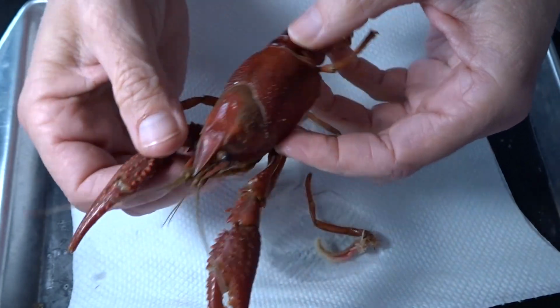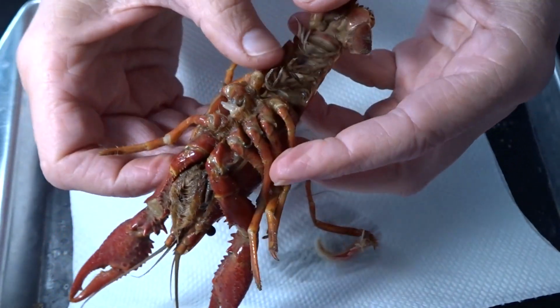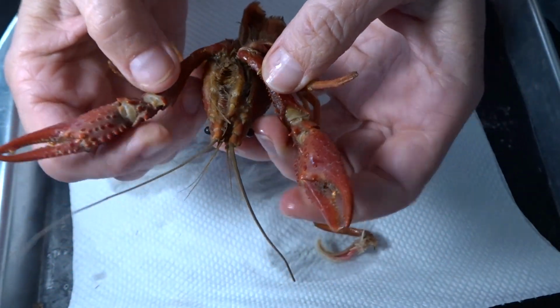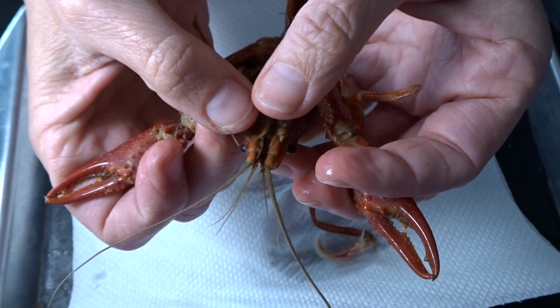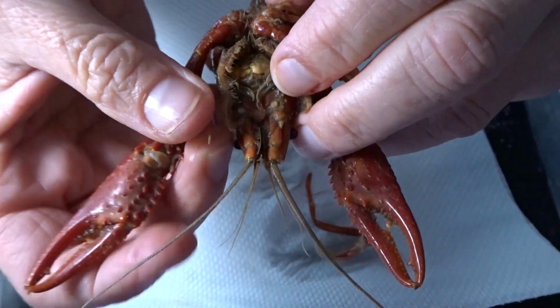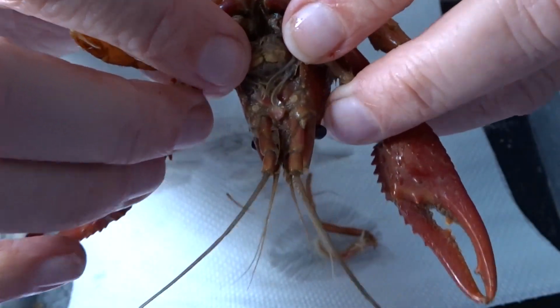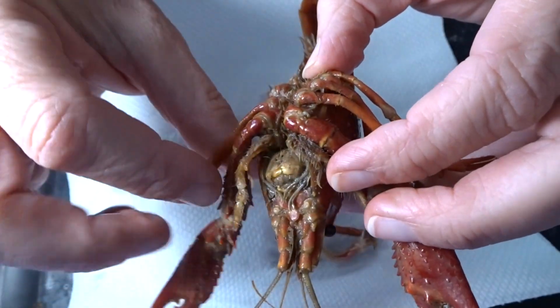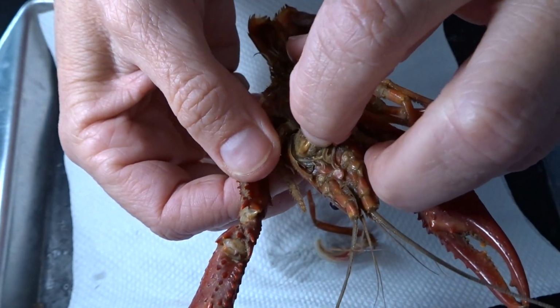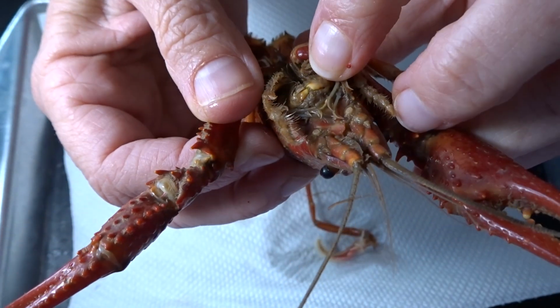Okay. If you were going to look at these parts of this crayfish, we're looking down here, we see all the walking legs, right? These crazy appendages up here, the maxillipeds, and then you can see their jaws. Right here, they are very hard, and they open laterally. If you were in the classroom, you could see teeth on them.